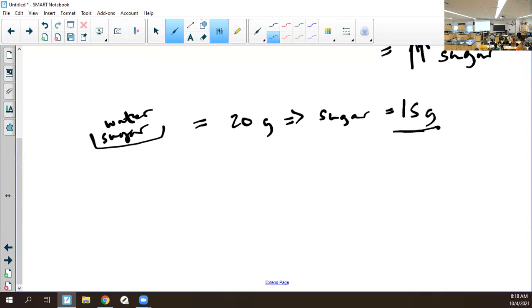Why did we get so much more mass? Because there's still water. It seems kind of silly, like, why am I asking why do we have so much mass when I specifically said there's water in it? But you could say maybe that we didn't let it dry enough. I didn't tell you how long I dried my sample for. There could still be water in it. All right, so again, make sure we've got our procedures written.